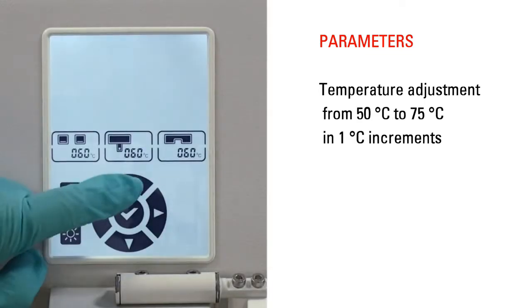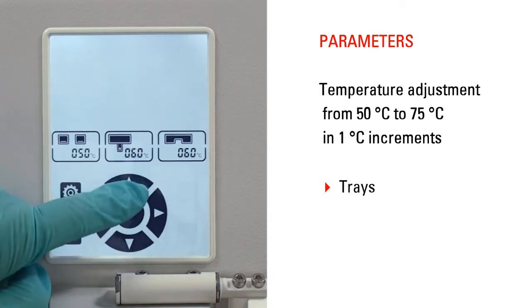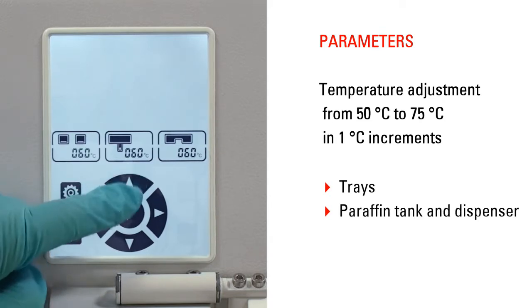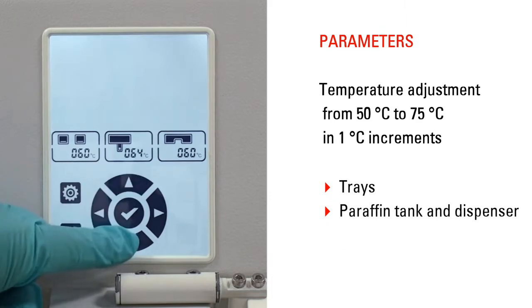The temperatures for the instrument's different heating areas, such as trays, paraffin tank and dispenser, and working surface and forceps holder can be adjusted separately from 50 to 75 degrees Celsius in 1 degree Celsius increments.